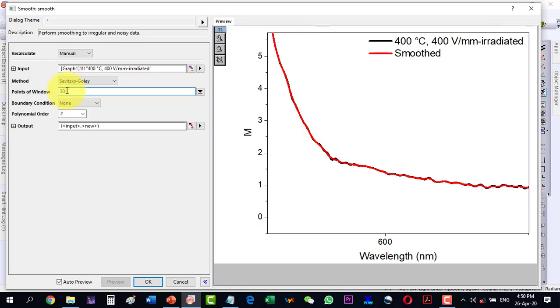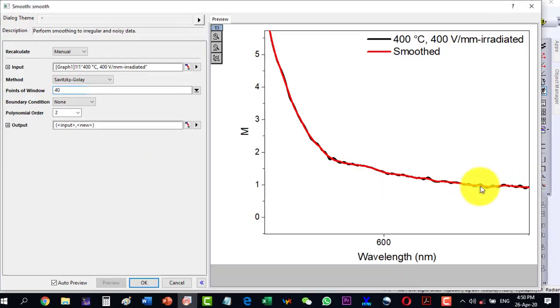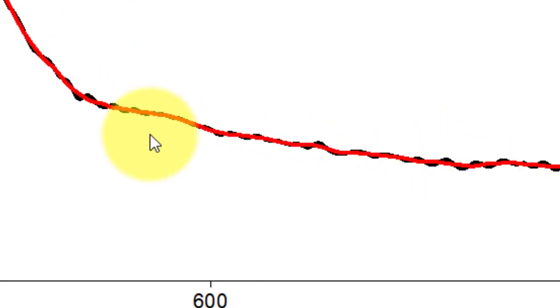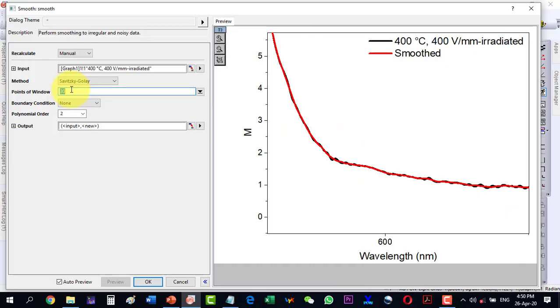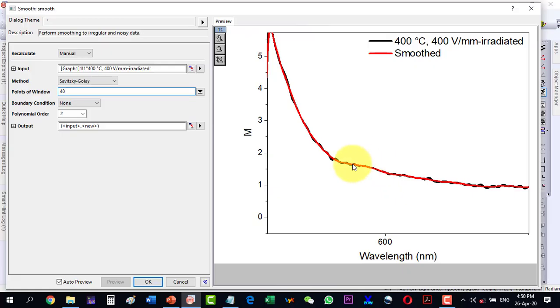Increasing the window points further to 30, we can see that the black original is appearing in more places. Moving to 40, we can see that the oscillations have been smoothed out. This way we have removed the oscillations. If we were fitting with an exponential we would lose the broad peak, which is experimental, but these oscillations are not experimental and we can smooth them out.